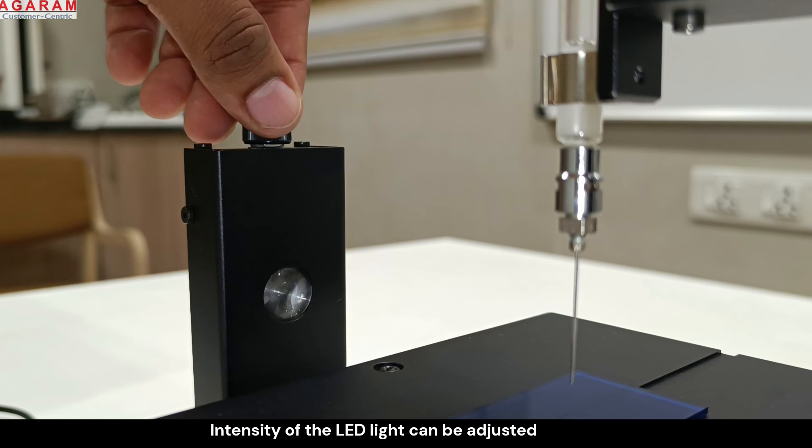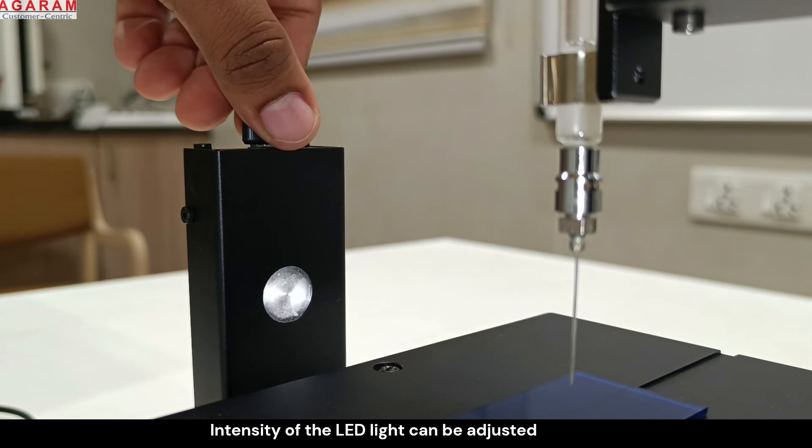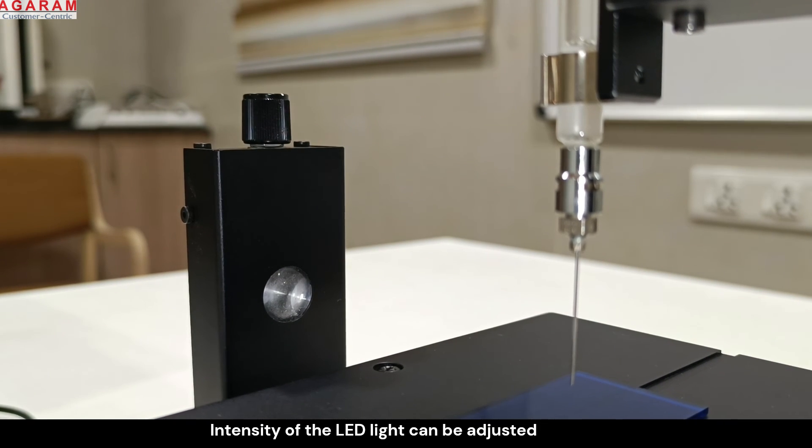Adjustable LED light for optimal image quality irrespective of the external light conditions.